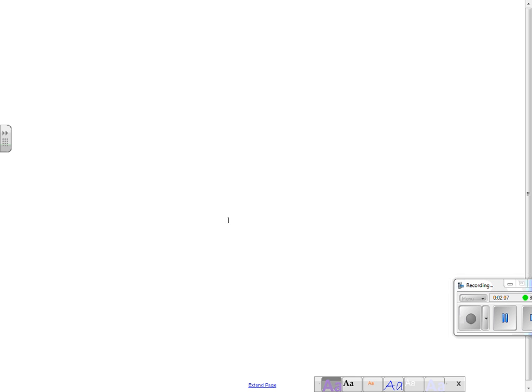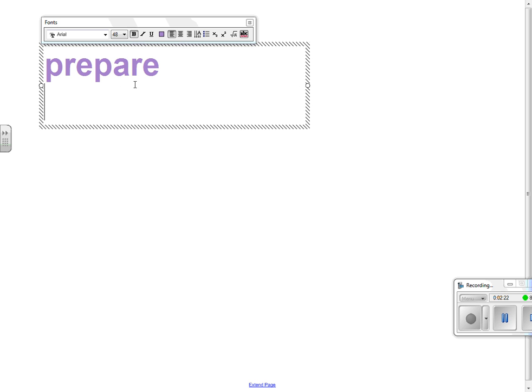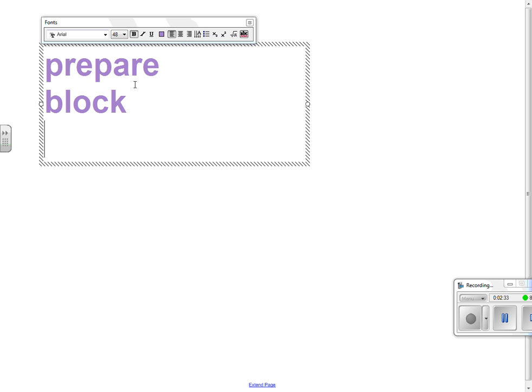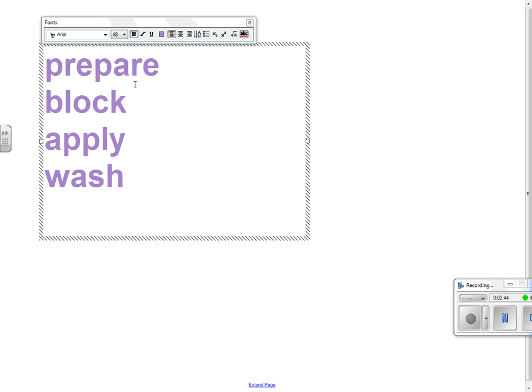Now, more specifically for the ELISA technique, I can tell you how you do it. And there's a few repetitive steps, and they start with similar words, so I'll write them down for you. It is prepare. Then first you prepare a surface to which a known quantity of capture antibody is bound. Then you block any non-specific binding sites on the surface. Then you apply the antigen-containing sample to the plate. Then you wash the plate so the unbound antigen is removed.